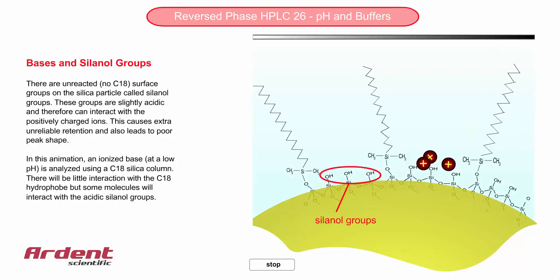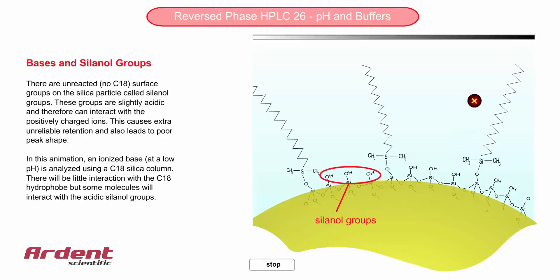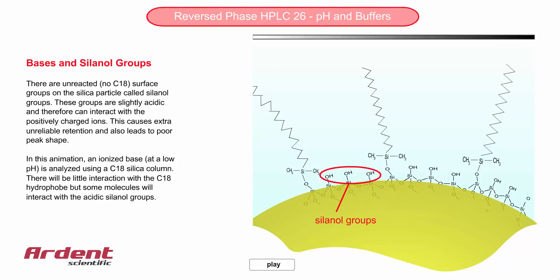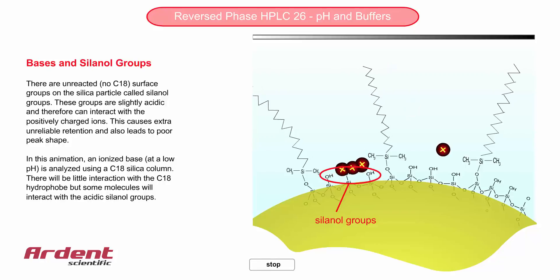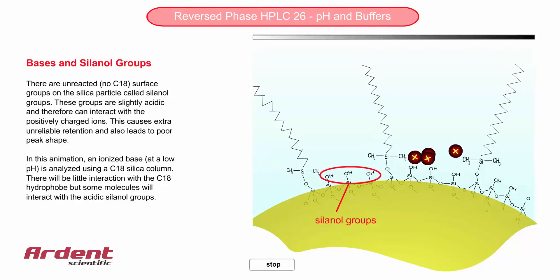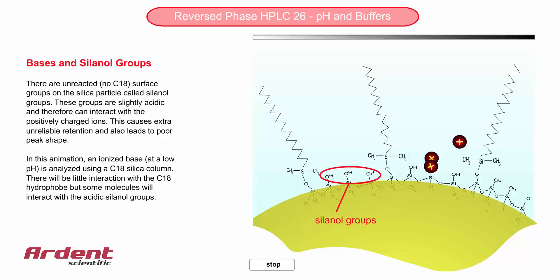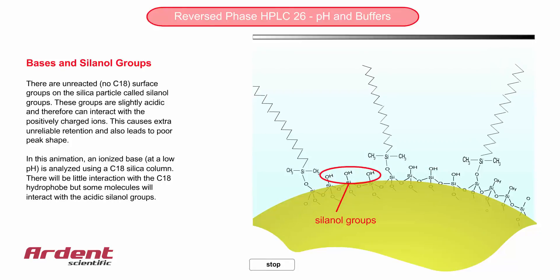For the analysis of acidic and neutral compounds, the presence of these unreacted silanols is not a problem. But basic compounds can interact with these silanol groups, because the silanol groups are weak acids. In this animation, the pH is low, and we are analyzing a base which will exist in the protonated or ionized state.